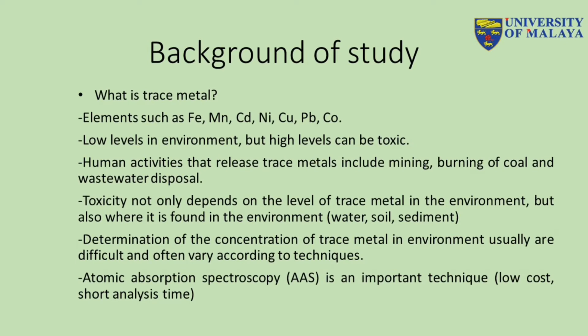Trace metals are elements such as ferrum, manganese, cadmium, nickel, copper, lead and cobalt that normally occur at very low levels in the environment. Usually, living things need a very small amount of some trace metals, but high levels of these metals can be toxic. Trace metals are usually released through human activities such as mining, burning of coal and wastewater disposal.